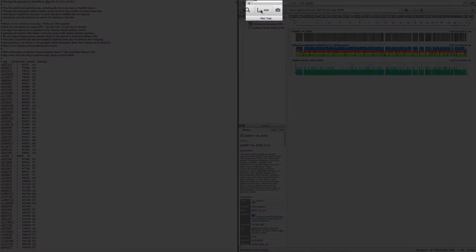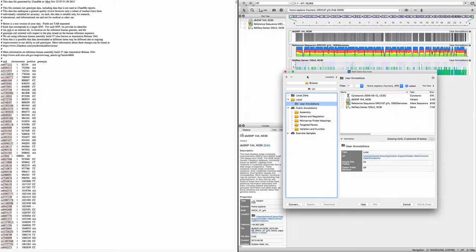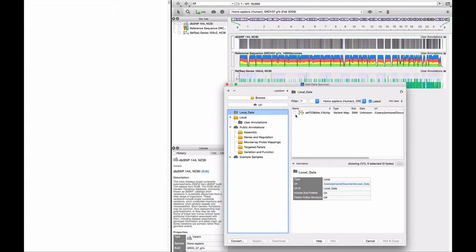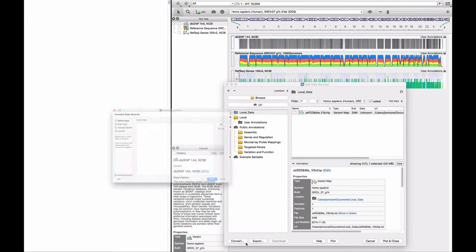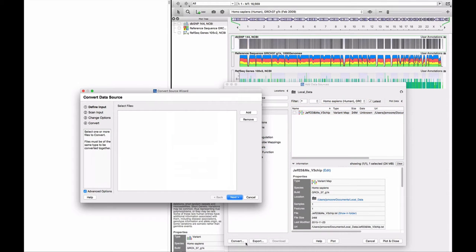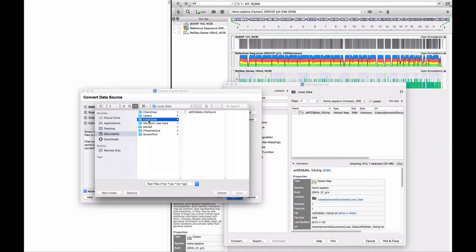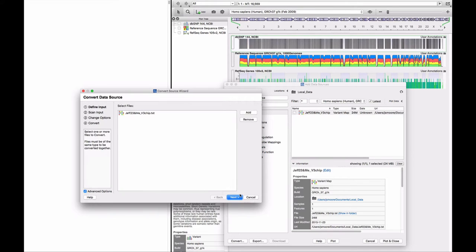Click the Add button to add a data track. A copy of my raw data file is in the folder called Local Data. Click on Convert to launch the Genome Browse Data Conversion Wizard. Click the Add button and navigate to the raw data file. Select the file and click on Open.